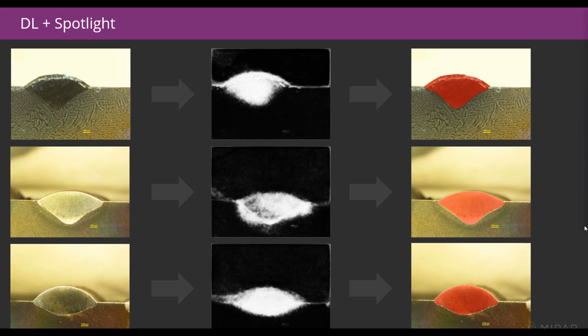So scratches can be ignored either by detecting them with a trained model and overlooking them, or training your model to basically see through them. If you have scratches in your grain structure and you're using a deep learning based approach, you can make your annotations in such a way that the software learns to overlook those scratches or other defects. So there's no one magic bullet that lets us ignore any image complexities. But again, that integration of those three technologies allows the software to be configurable enough and flexible enough to learn to handle those challenges.